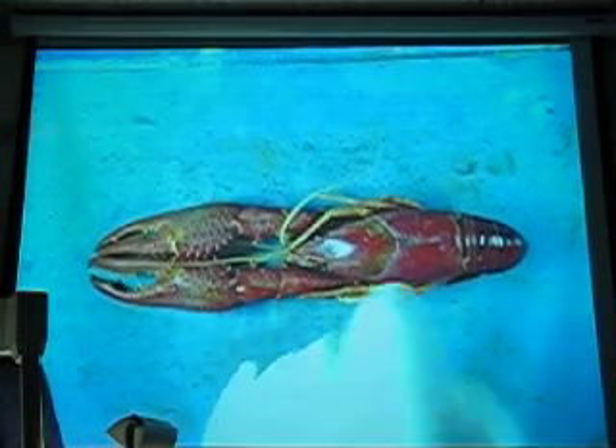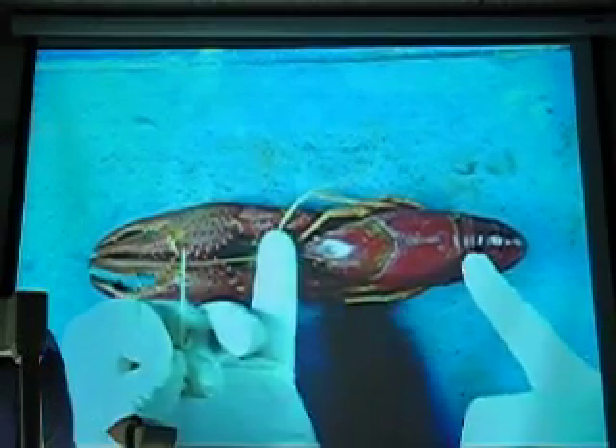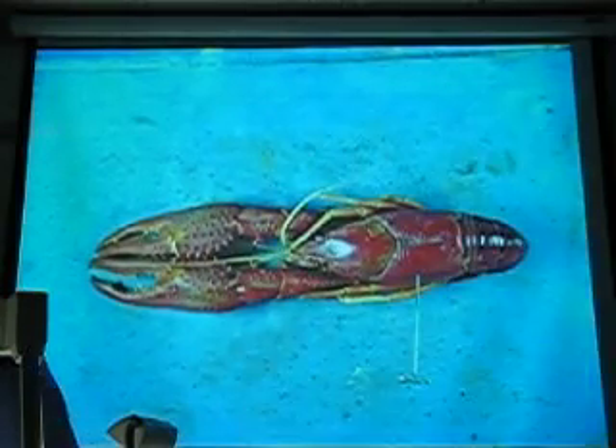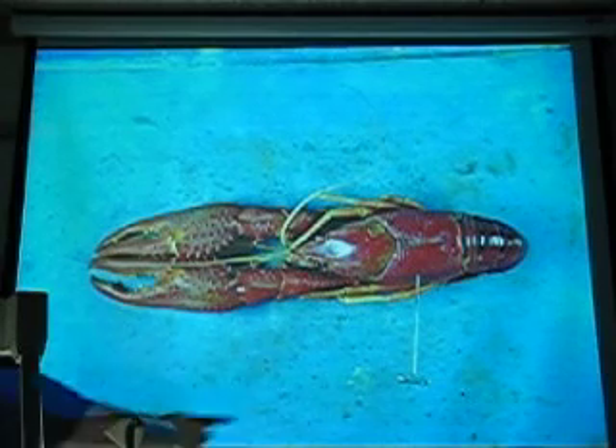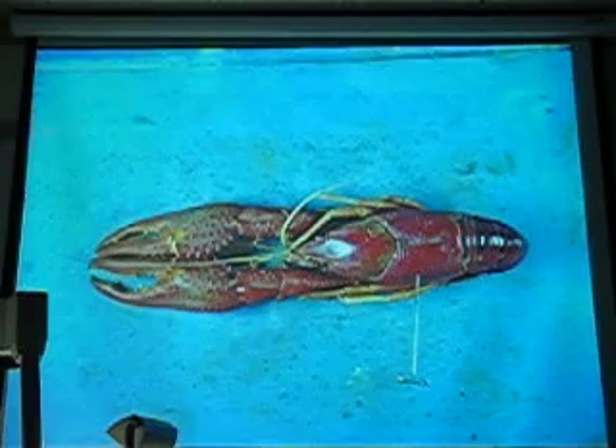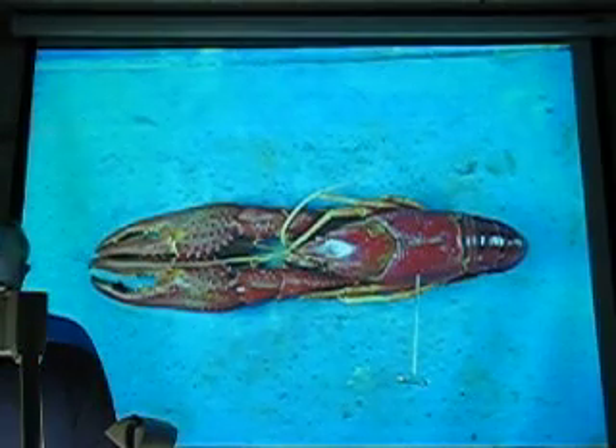And what about if I ask for this body section between my feet? Cephalothorax. And then if you get to the lab practical, it looks like this and there's a number on this pin — that means I was running out of time. Carapace. And then I'll say, what structure is pierced by this? And Vincent will answer carapace.